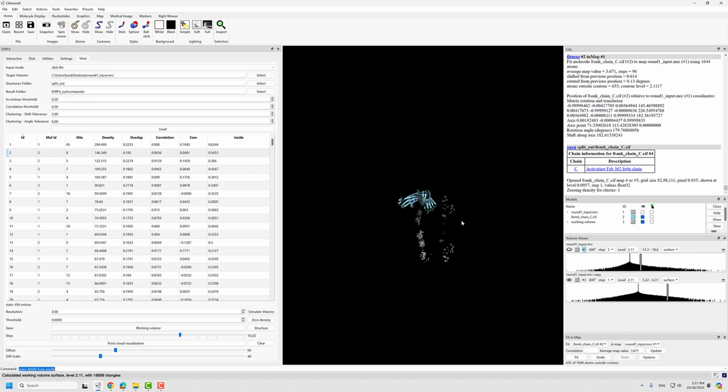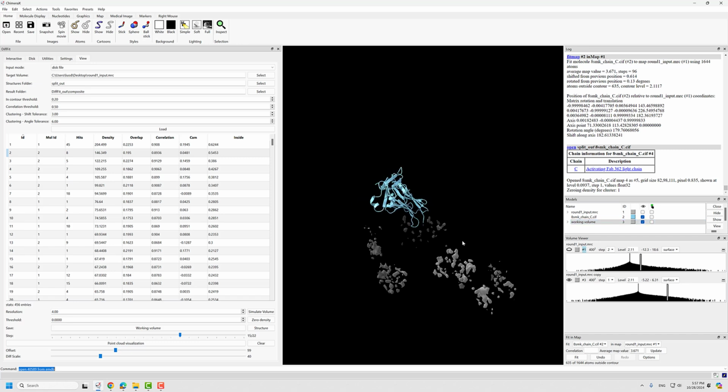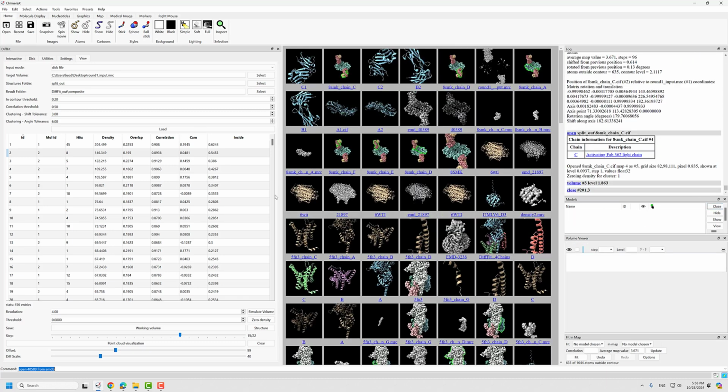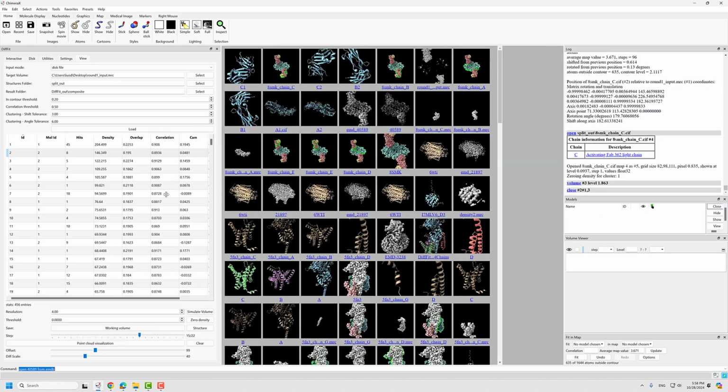So now at this stage, one will need to make a decision whether or not to further save the working volume and fit it again. You might even need to change the threshold value to see if you can fit more objects. Now, I think it's easy to come to the conclusion that there is nothing left. So let's close them all, and let's open the ground truth and our fitted result.